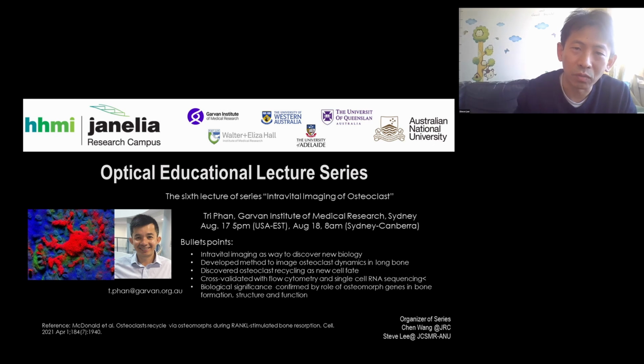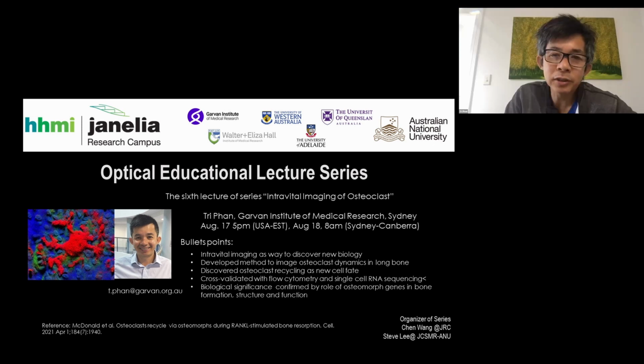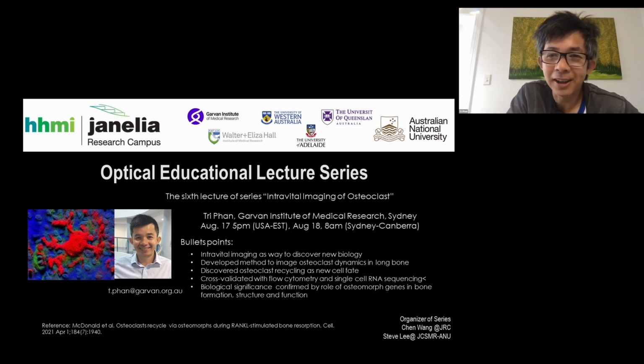Cool. And you're right, Chen, because when we have tried to measure the chromatic aberration in our lymph node, we get a little bit, not too much, but in the bone, everything is just magnified, because of the cortical bone that you have to go through.